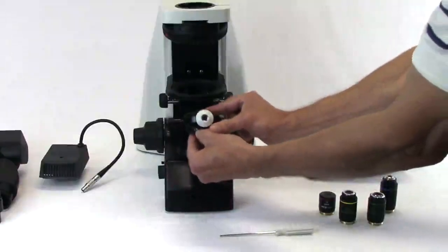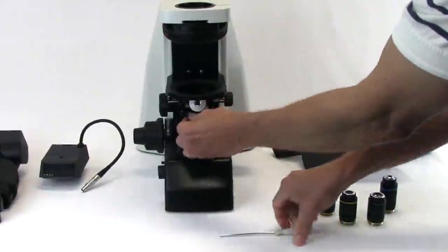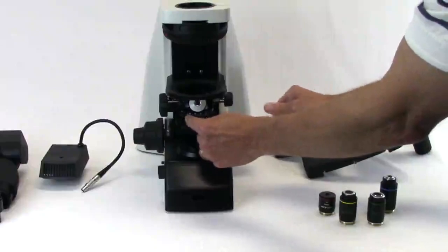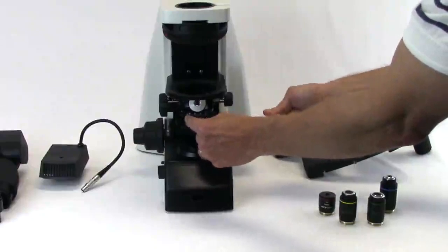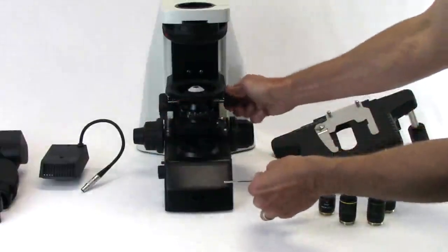Position the condenser with the centering pin facing toward the back of the dovetail slider. Slide the condenser into place and wiggle it to ensure the positioning pin is engaged. Gently re-tighten the lock screw.